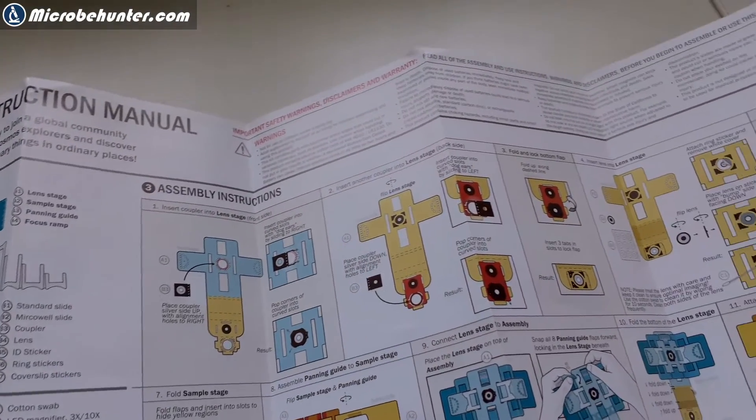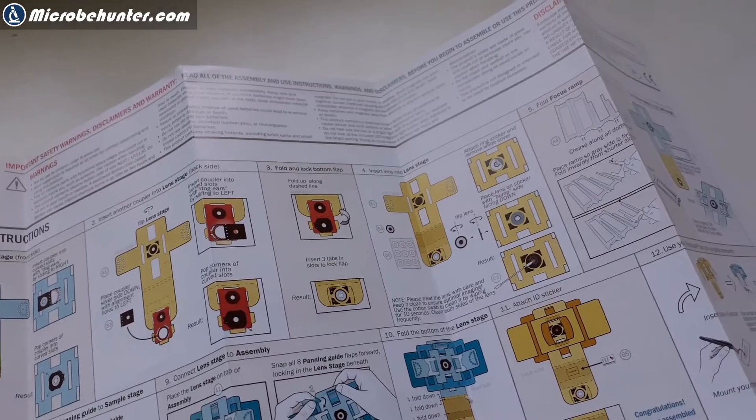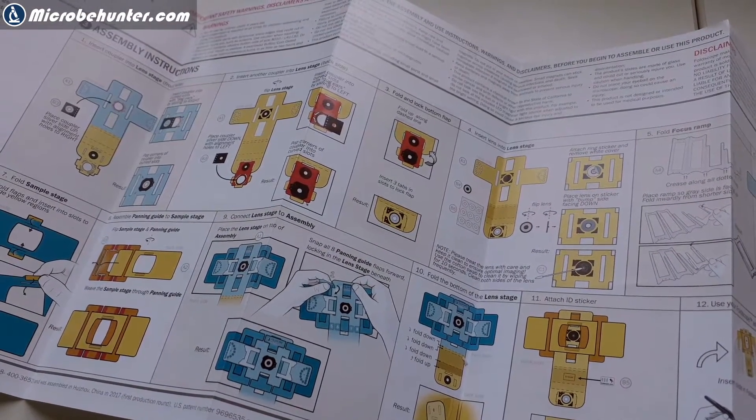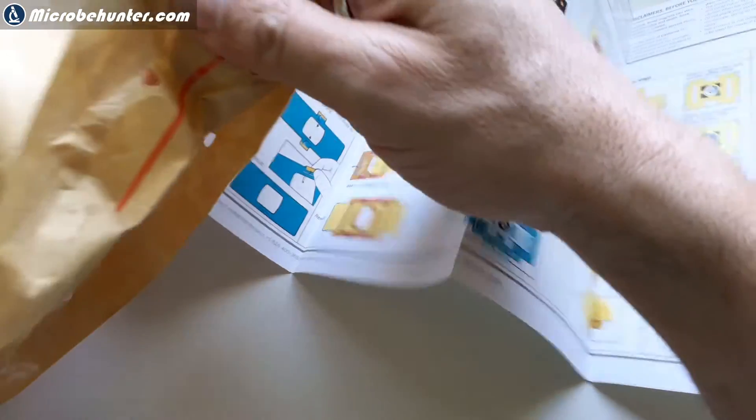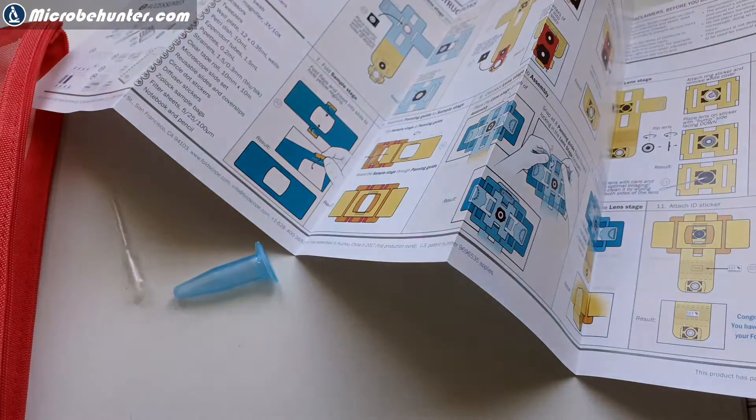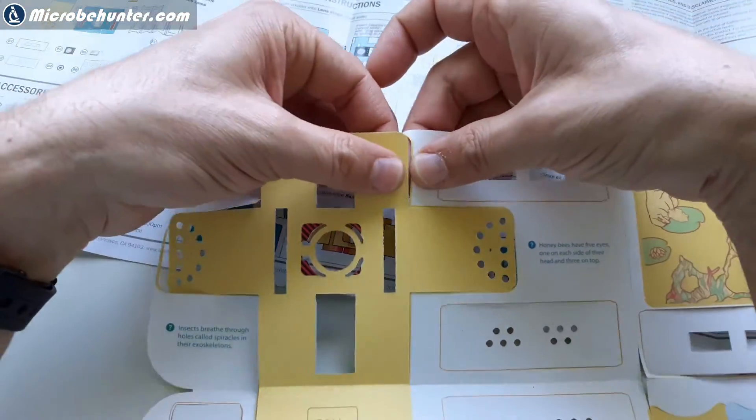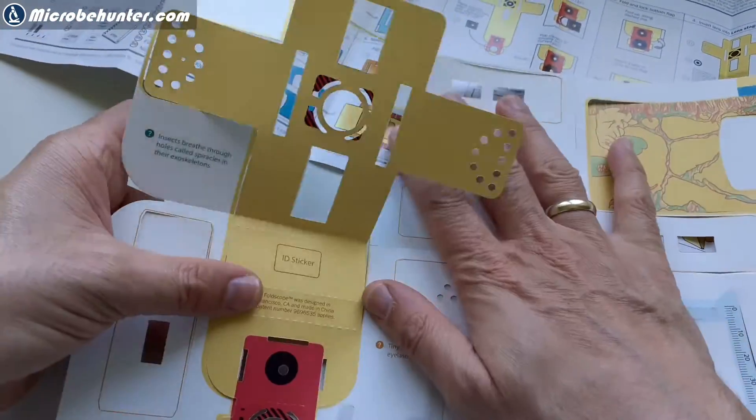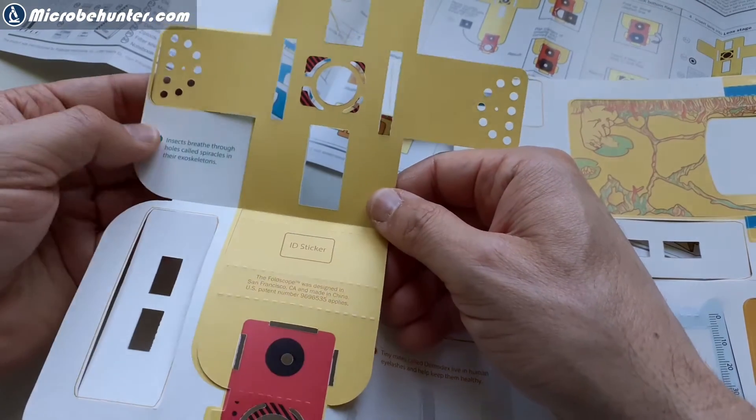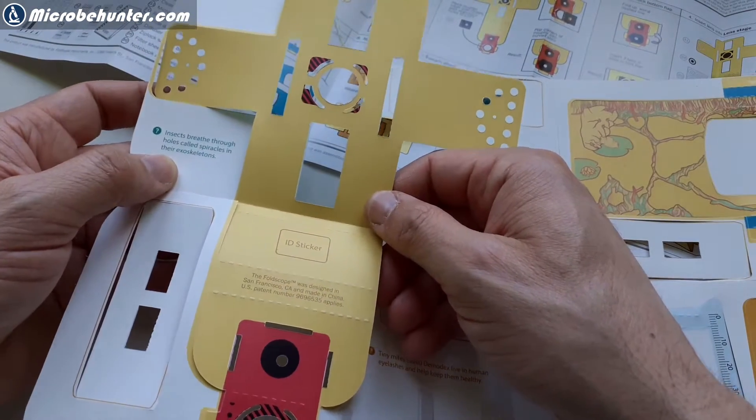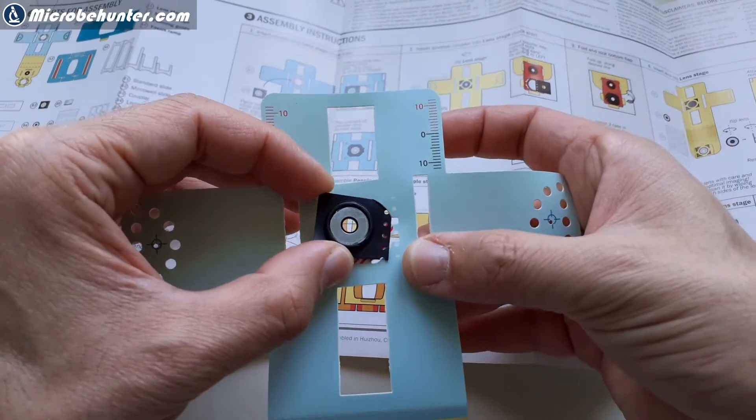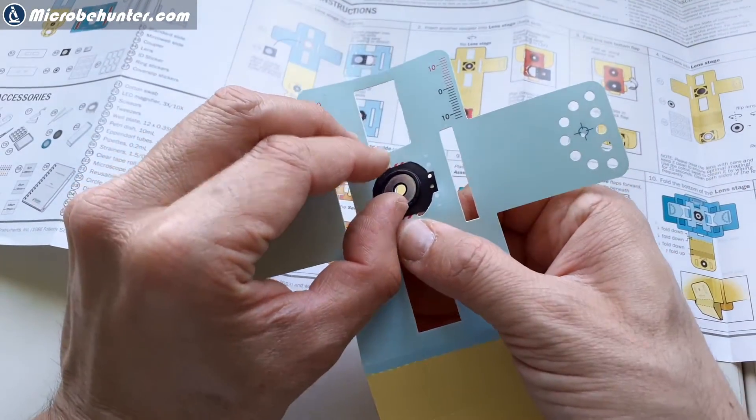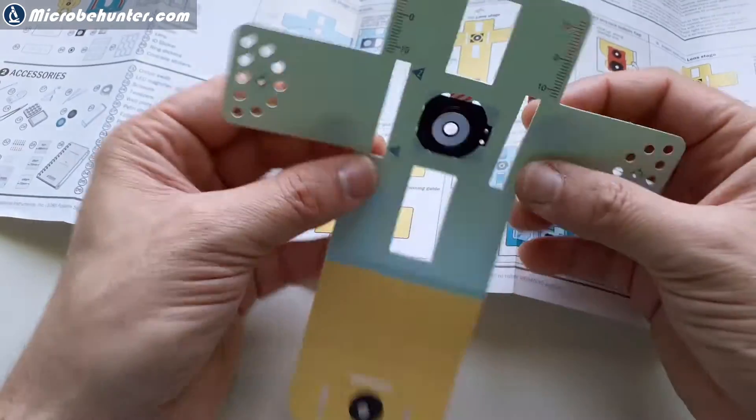The instructions I think are pretty good. They're very detailed. I think the drawings also very clear. I think a little bit small for my eyesight already and what I kind of liked is that the instructions were extremely self-explanatory in that sense. Here there were some more things here. Self-explanatory in the sense also that the drawings alone sometimes were also enough to actually understand what was going on. But sometimes it did have a little bit of a problem though, but generally it worked quite well and there were some quite interesting quotes here also written on the Foldscope.